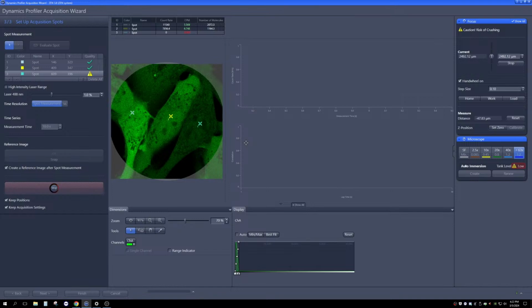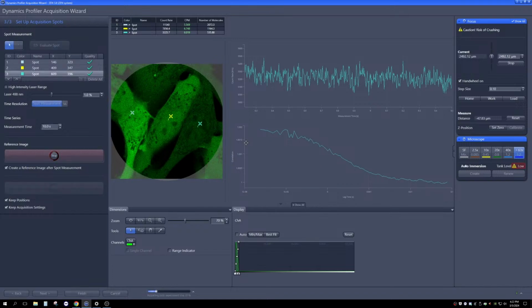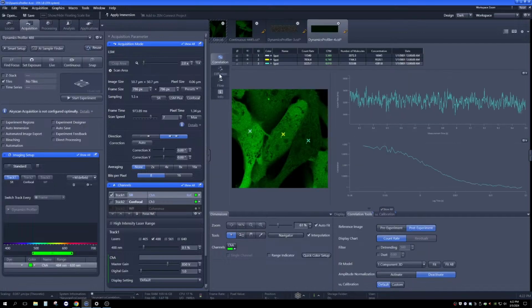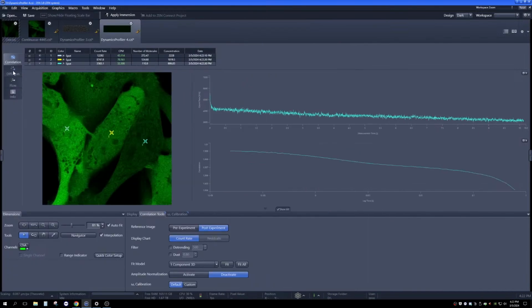And as soon as it's done collecting measurements, it'll launch into those 3 different tabs. You will always be able to look at diffusion and concentration. That's the first tab. You will also be able to look at those heat maps. It is the second tab. I'll show you in a second. So correlation, which is we can get diffusion kinetics of that. Actual diffusion across a membrane is this tab, and then flow. So you always get all 3 of these tabs. So if you save data, you realize later you want to double check if there's something interesting happening, you have it here. Or maybe just while you're sitting in front of the system, but it's always saved. You don't lose that. Okay, so let's go ahead and look at all 3 of these.